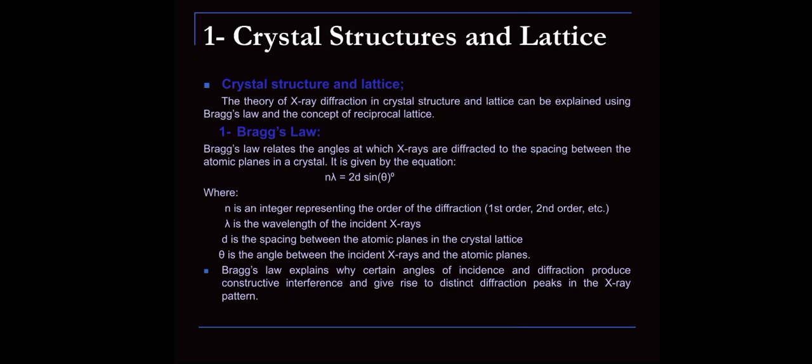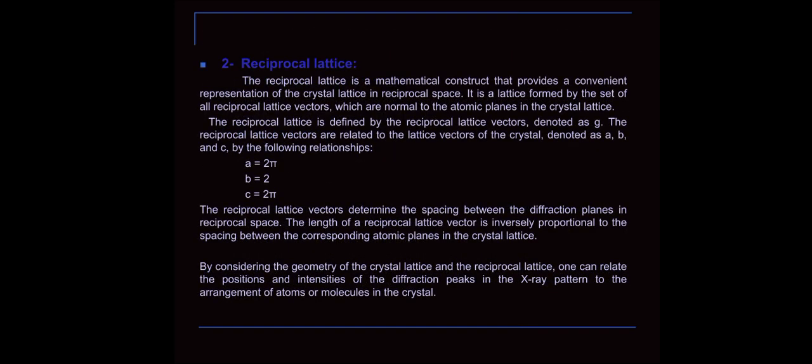Bragg's law explains why certain angles of incidence and diffraction produce constructive interference and give rise to distinct diffraction peaks in the X-ray pattern. Now, reciprocal lattice. The reciprocal lattice is a mathematical construct that provides a convenient representation of the crystal lattice in reciprocal space.